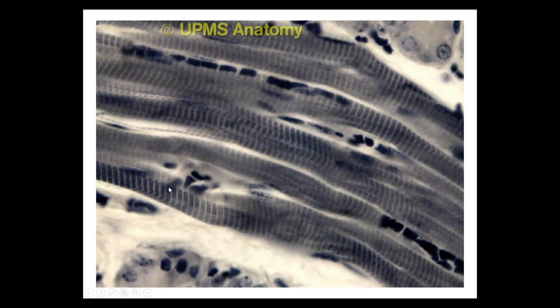Here in this region, they don't overlap with the actin filaments, that is why it is lighter.